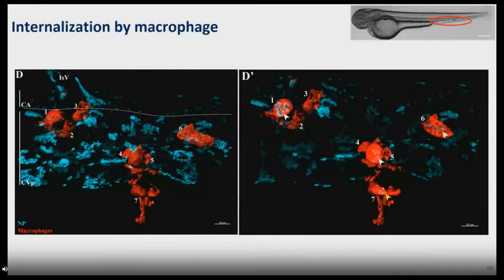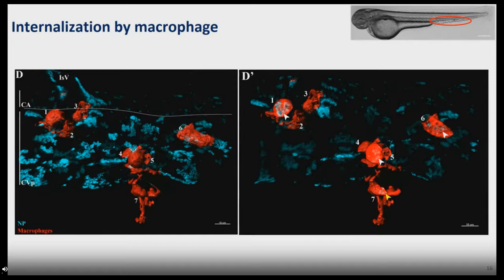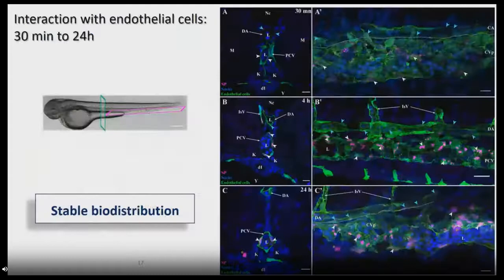We saw some phagocytes in the blood, so we looked at neutrophils first — using green fluorescent neutrophils — but we didn't see anything. Then we looked at macrophages using the mpeg1 line where macrophages are red fluorescent. In the image you can see the vein and artery, the nanoparticles in cyan, and red fluorescent macrophages. We recomposed the full 3D structure of the macrophages with Imaris and could open them up and confirm: yes, some macrophages contained nanoparticles. So within 20–30 minutes, nanoparticles are quickly internalized by both endothelial cells and macrophages.